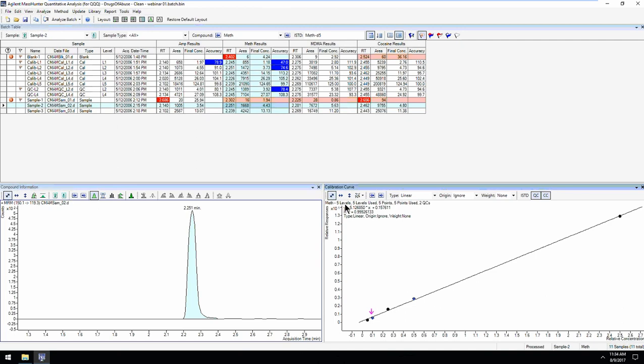Yeah, okay. There's not really a subheading that it would fall under, since it's information for the calibration curve, but it wouldn't really fall under a specific compound or a sample-based table. Yeah, I've not seen that option.